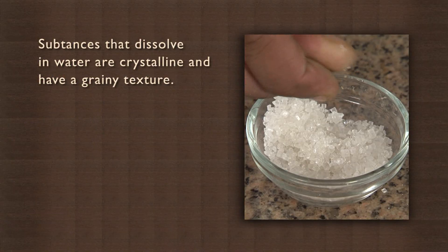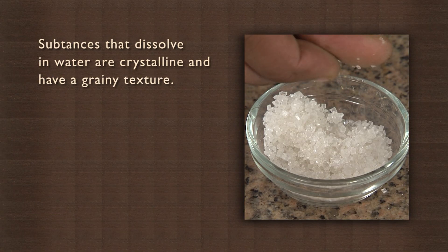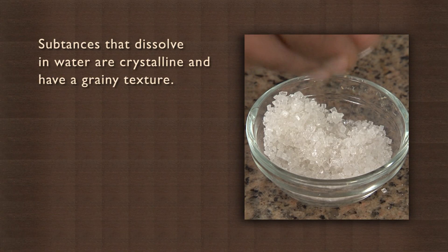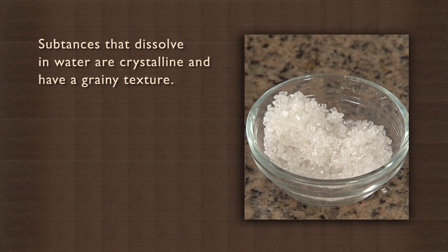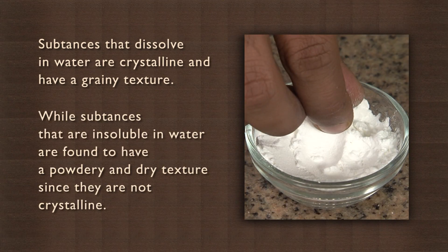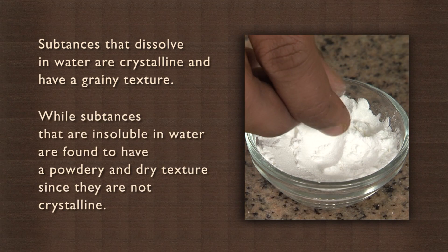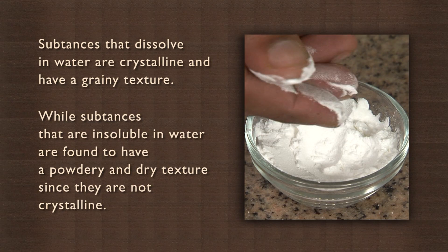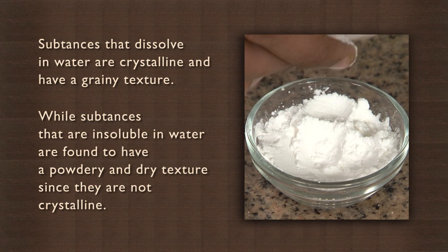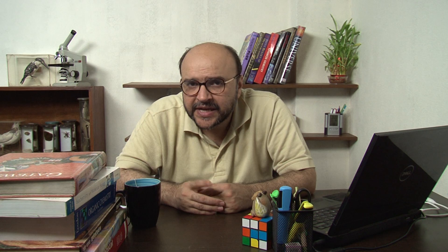After noting down all our observations, we find that substances that dissolve in water are crystalline and have a grainy texture, while substances that are insoluble in water are found to have a powdery and dry texture since they are not crystalline.